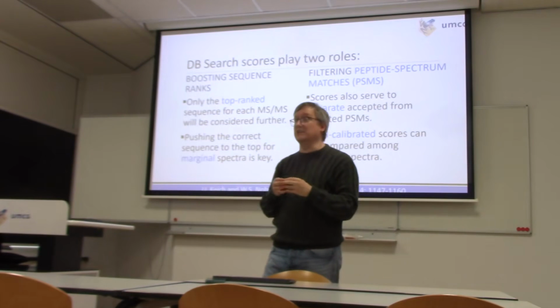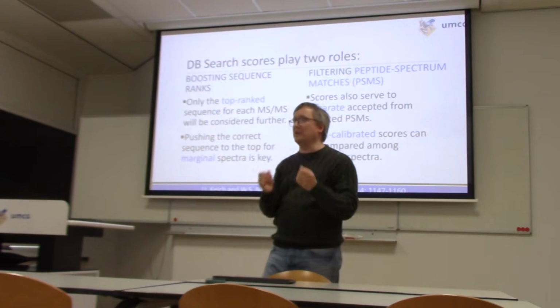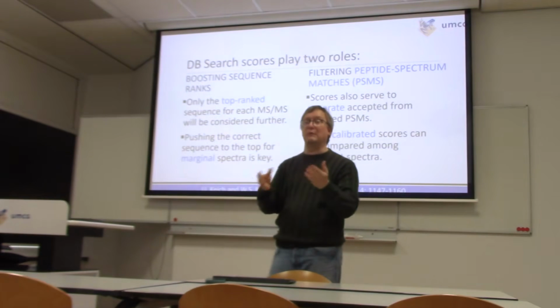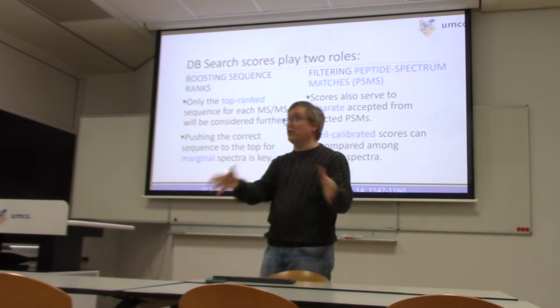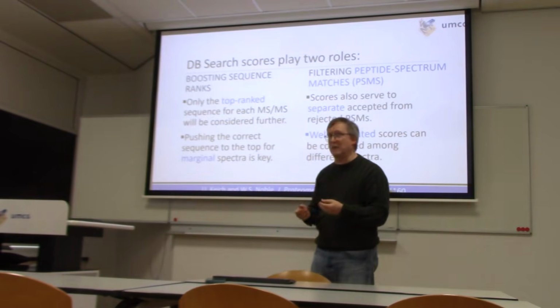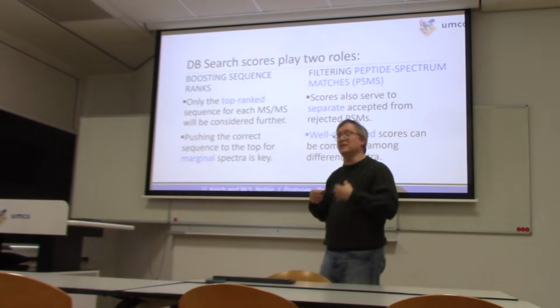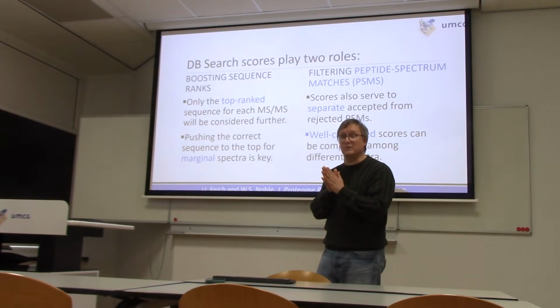And if you're dealing today with a microbe where you can grow up as much of it as you want and you don't have limitations on how much sample is available to you, and you have a pretty small proteome to work with because you're dealing with microbes rather than mammals, you can actually identify as many as 50% of the spectra that you collect on the instrument today.